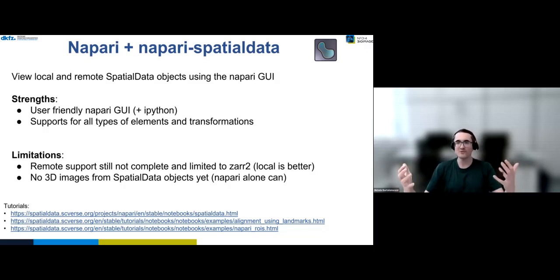This allows you to go a bit further with a more complex dataset.